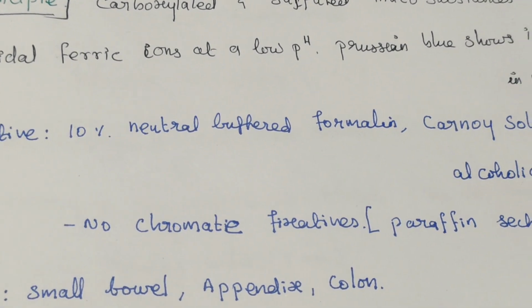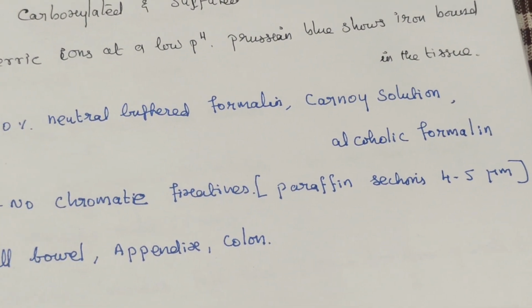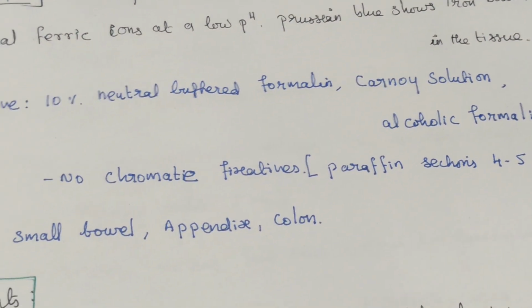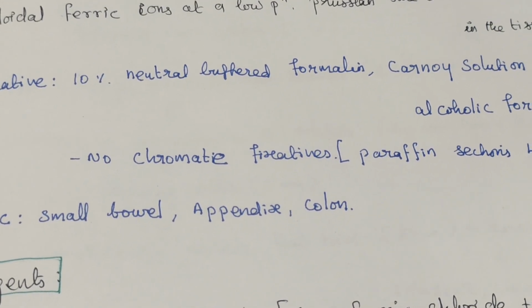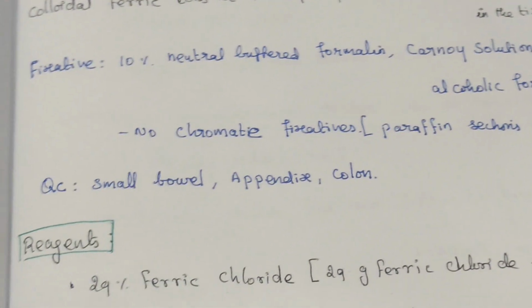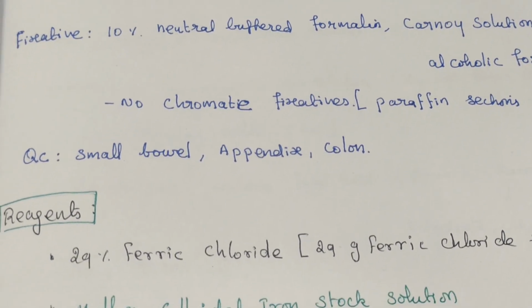Here the fixative we are using is 10% neutral buffered formalin, no chromate fixative. Then QC: small bowel, appendix and colon.